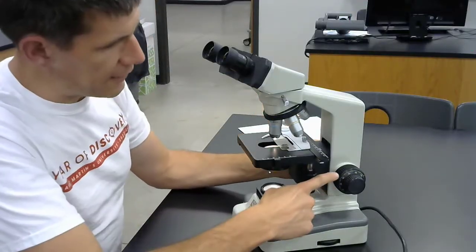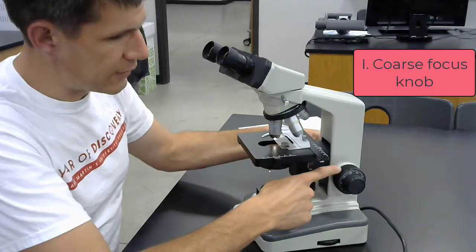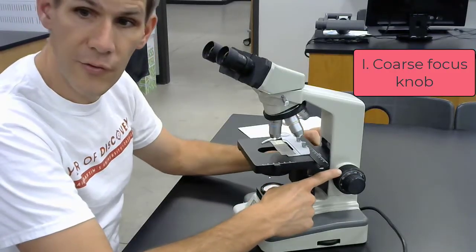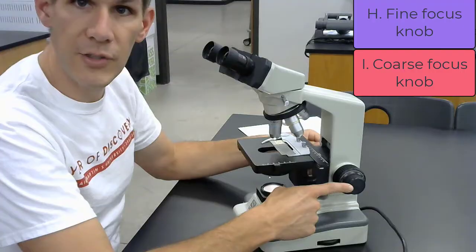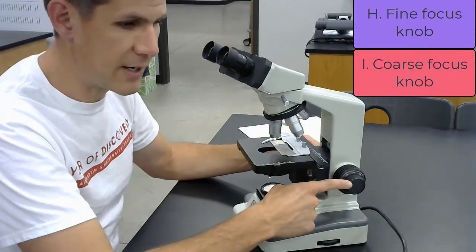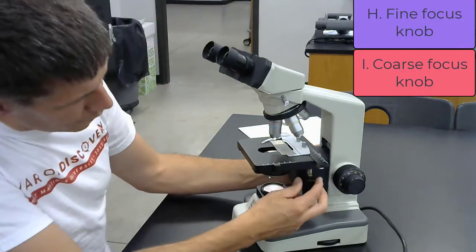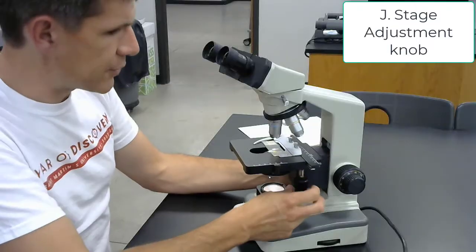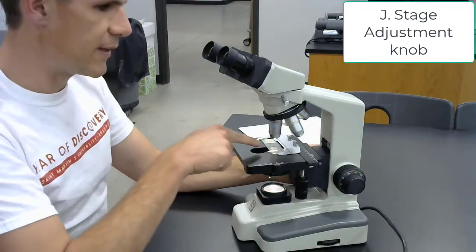Back here we have the coarse focus knob, which can move the stage up or down in a coarse manner, and the fine focus knob, which can move it up and down in a fine manner. Over here we have the stage adjustment knob, which can move the stage around and get the piece centered.